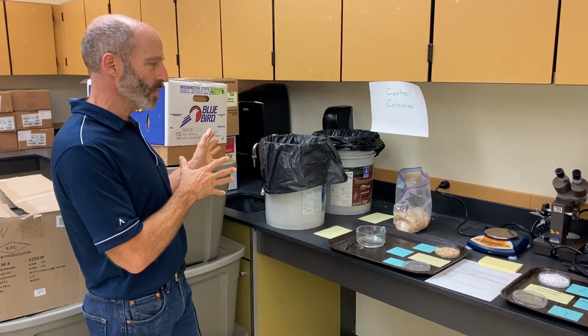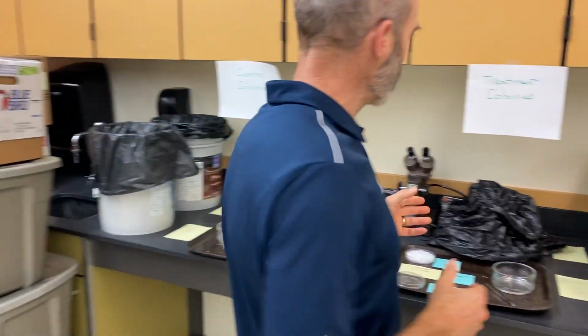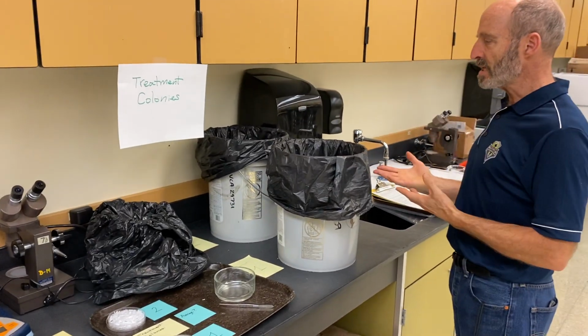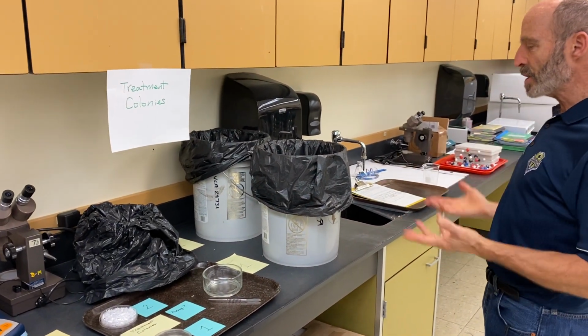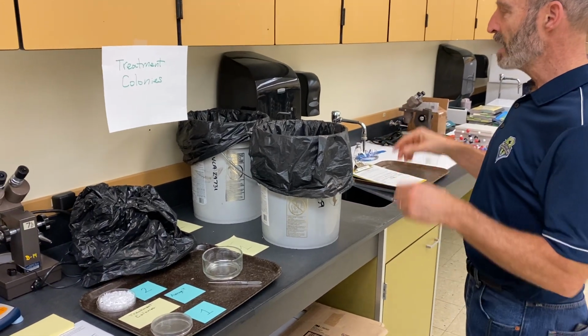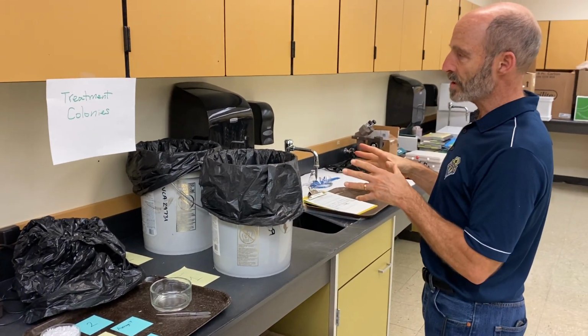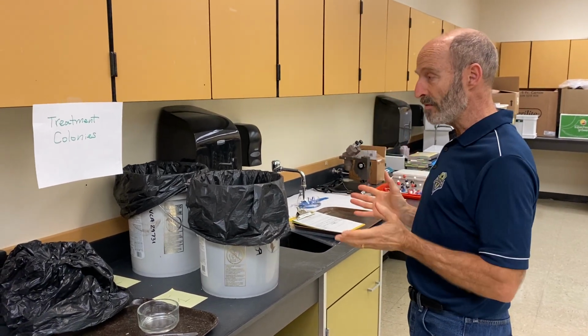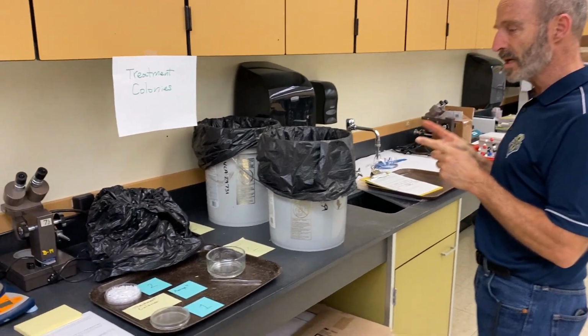That's like we need that for replication. The second population is a treatment population that is, once again, in two buckets. That gives us replication. We have what's called treatment bucket number 1, treatment bucket number 2. Once again, set up at the same time, same source of mealworms, same amount of bedding. We feed them the same amount by volume, but the difference is what we're feeding them.